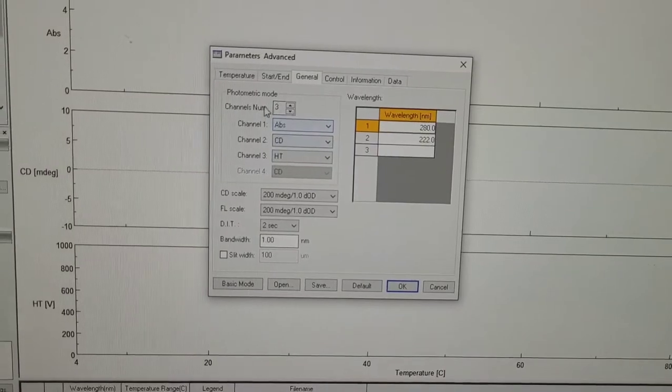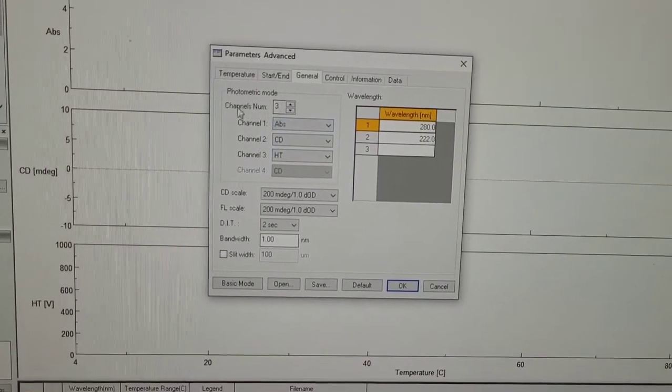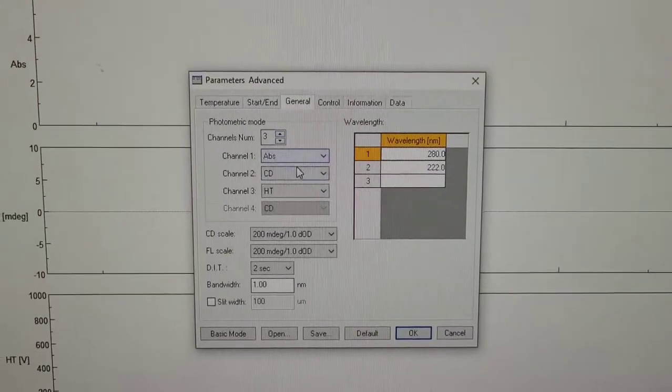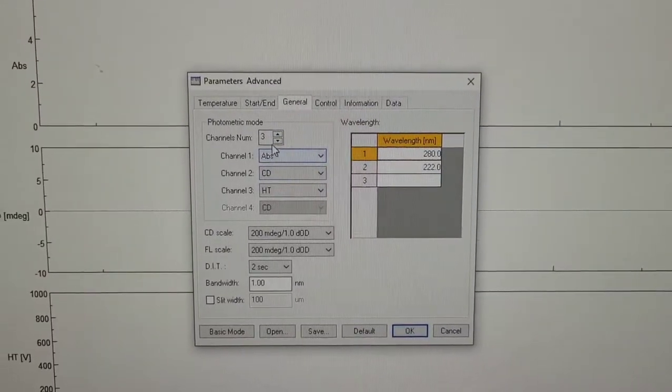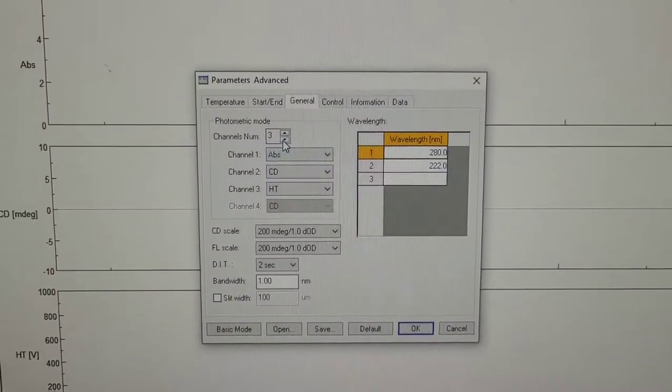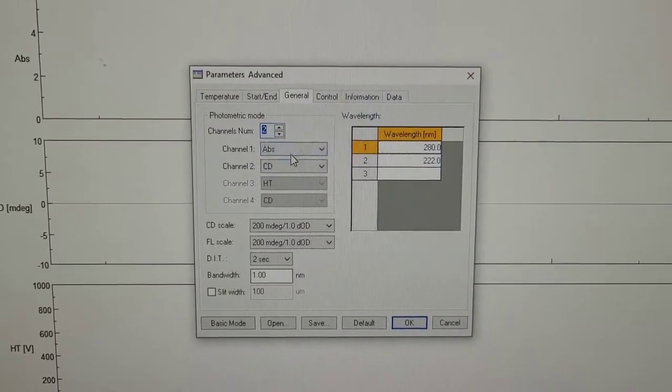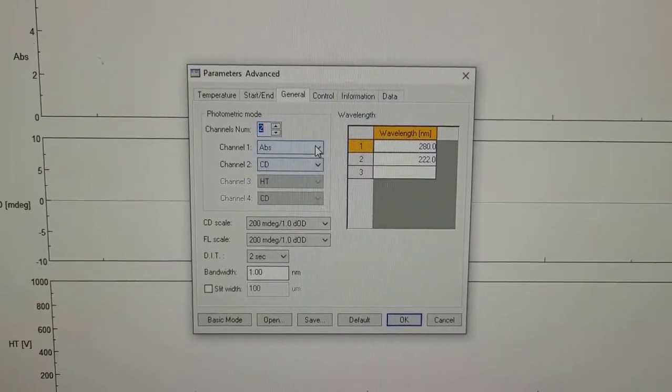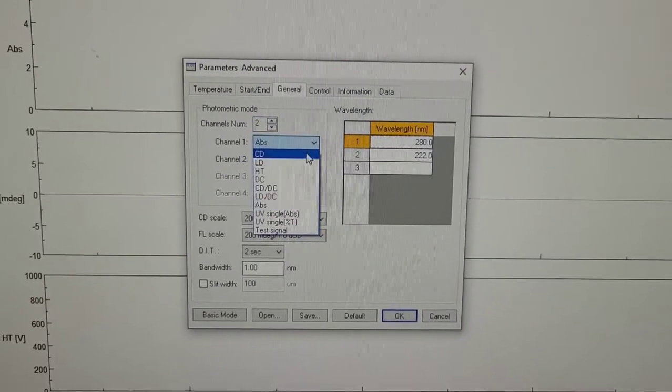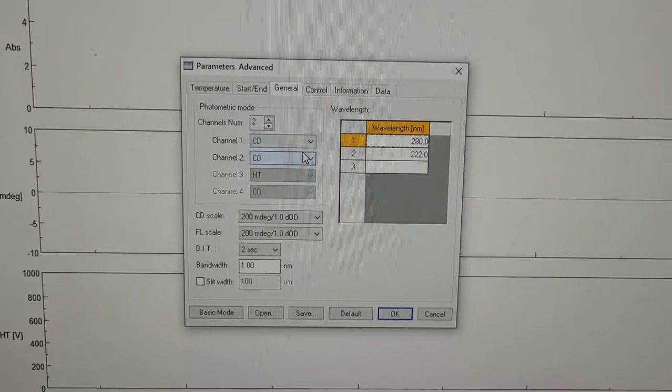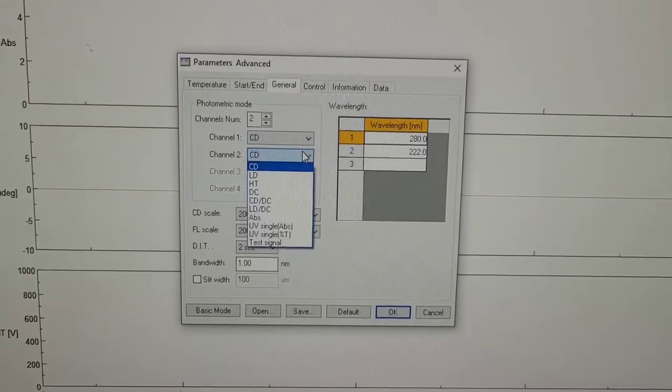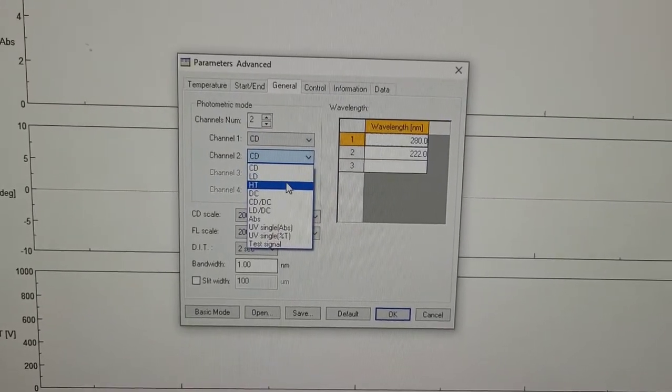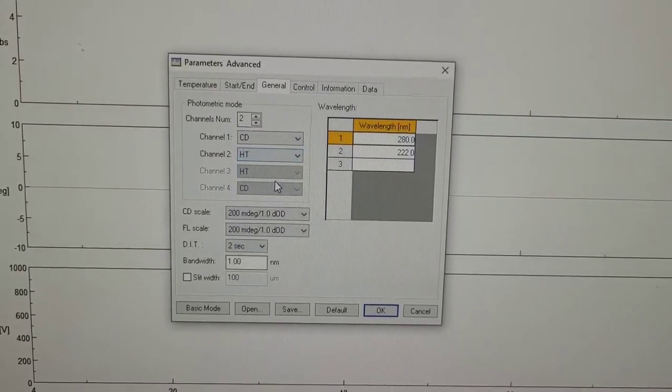Then which channels do I want to measure? I don't want to measure absorption. I want to just have two channels and for the first one, I want the CD and the second one is the HT.